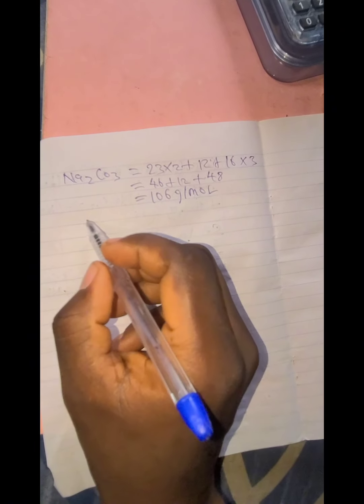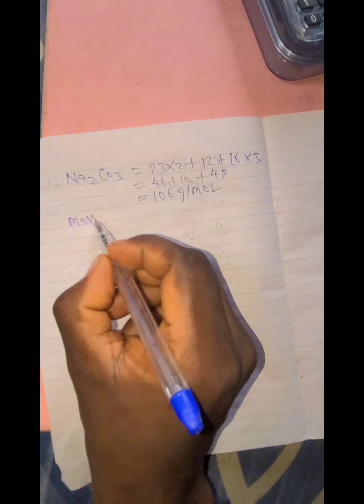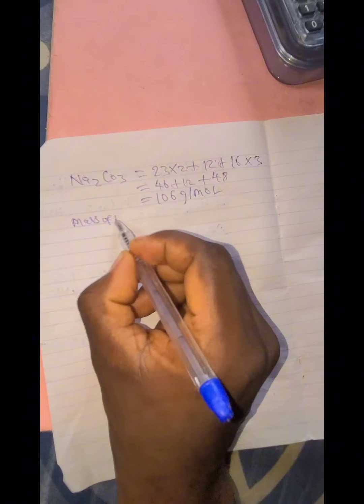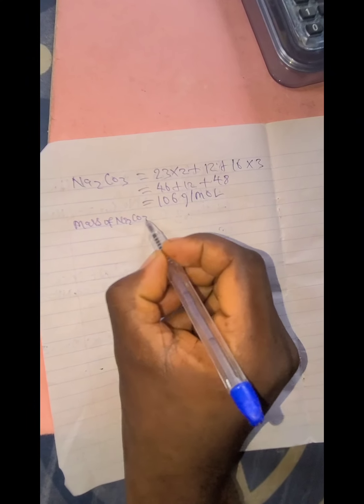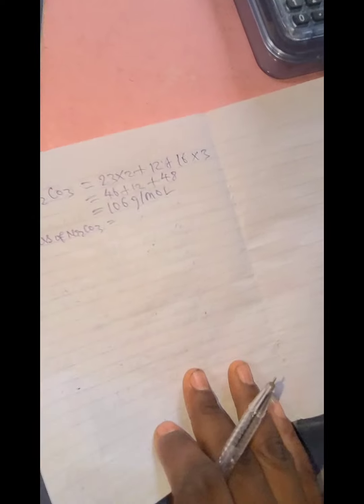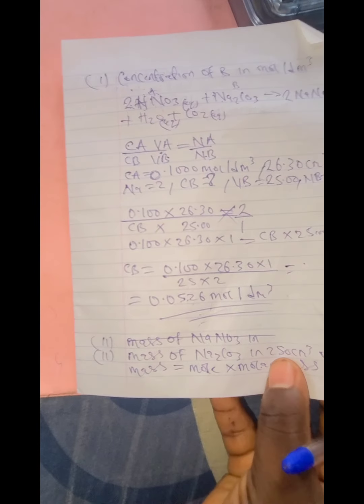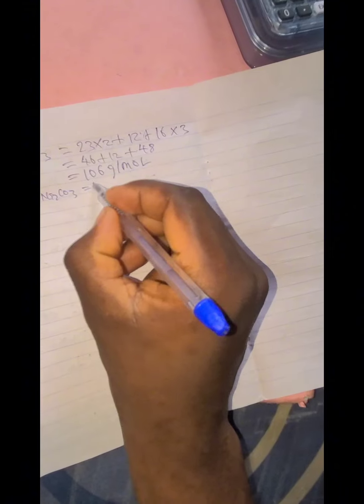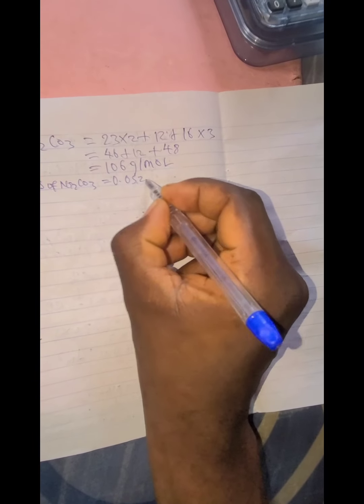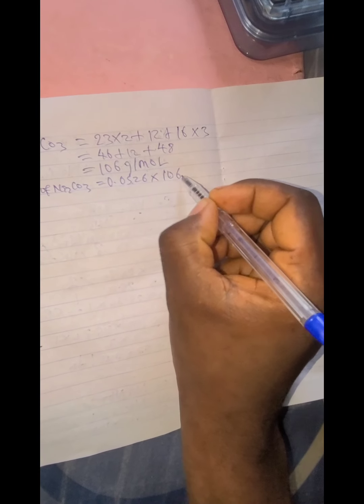So in that case, our mass of Na2CO3 will be our mole, which is 0.0526, times our molar mass, which is 106.